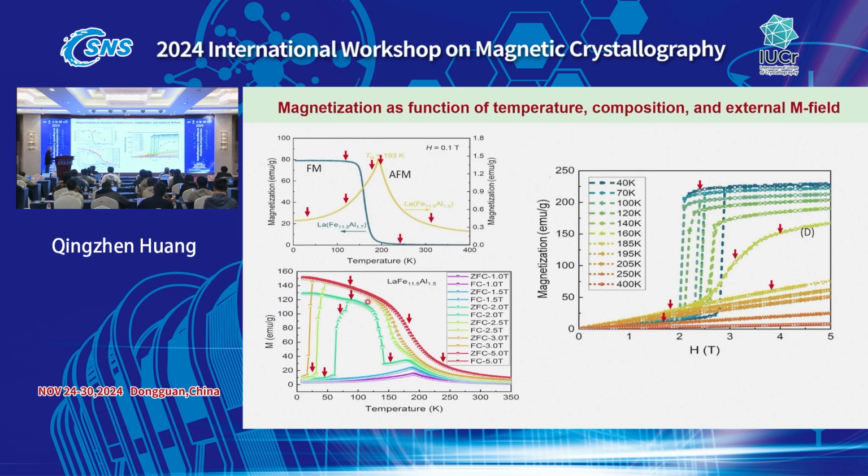And when the applied magnetic field goes up, this transition will change.